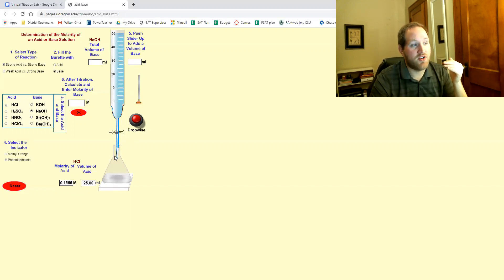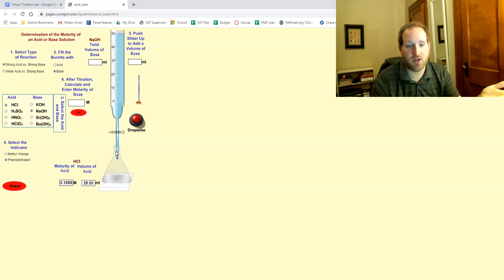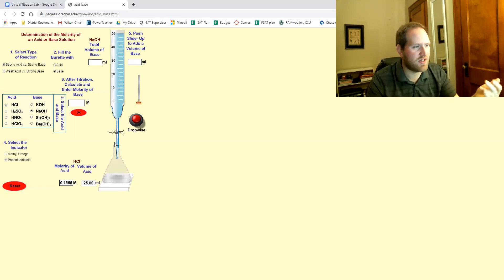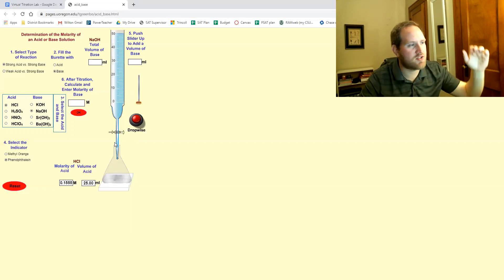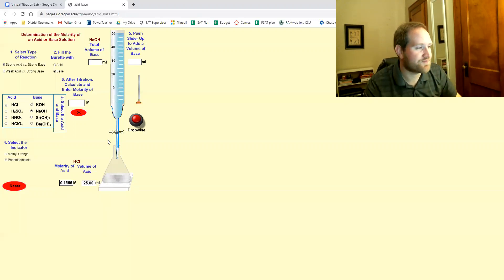Generally your unknown goes in the flask down here and your known goes in the burette. They switch it up for this animation but it's still totally fine. It doesn't matter which is which as long as you pay attention.